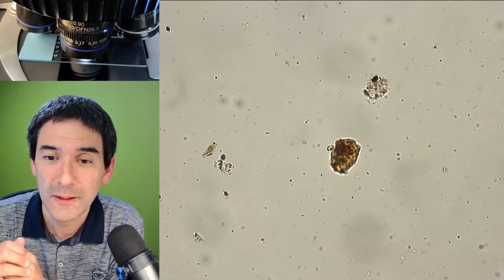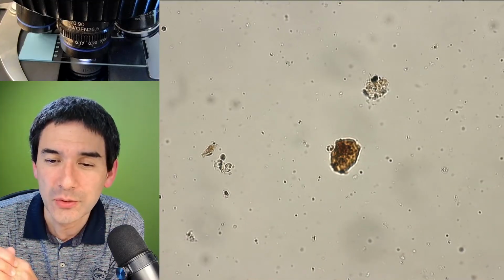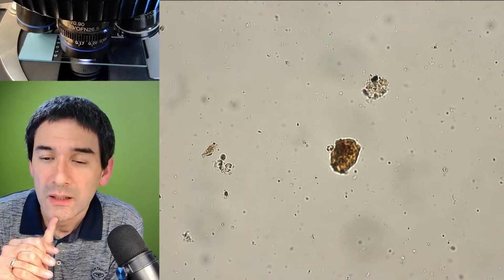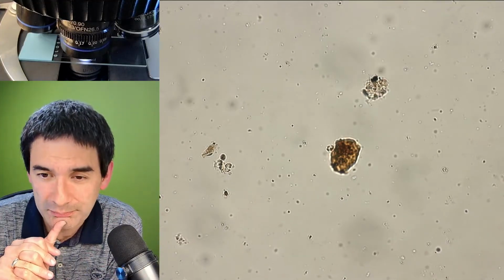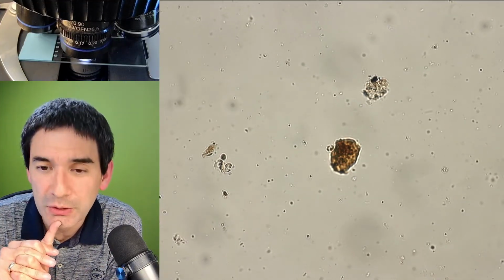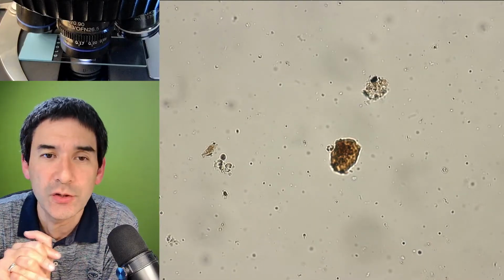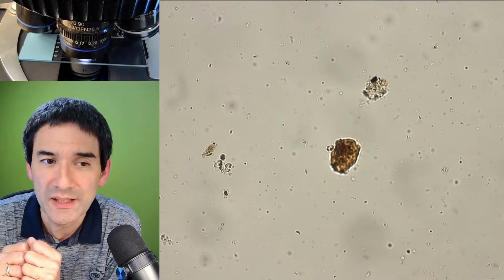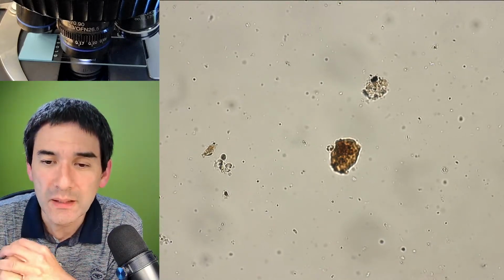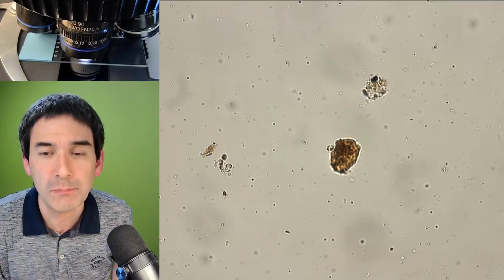Are there microbiological indicators for heavy metals that we might be able to see with a microscope? Microbiological indicators. That's difficult. Let's put it this way, not that I know of. When you refer to microbiological indicators, basically that we're able to see them in the types of cells that are present. Normally, those metals can be fairly easily detected by chemical means.